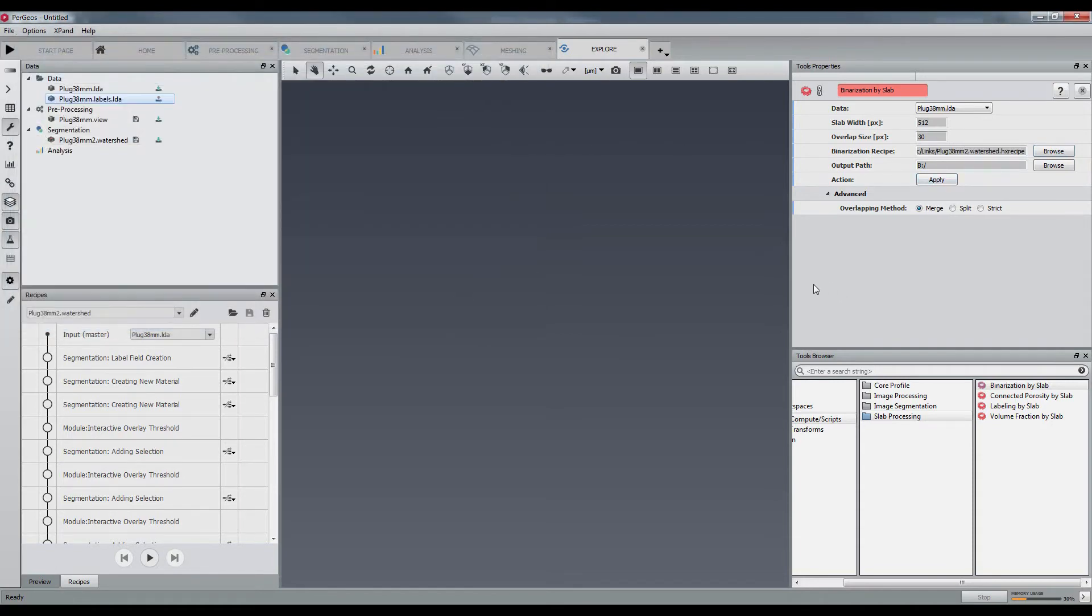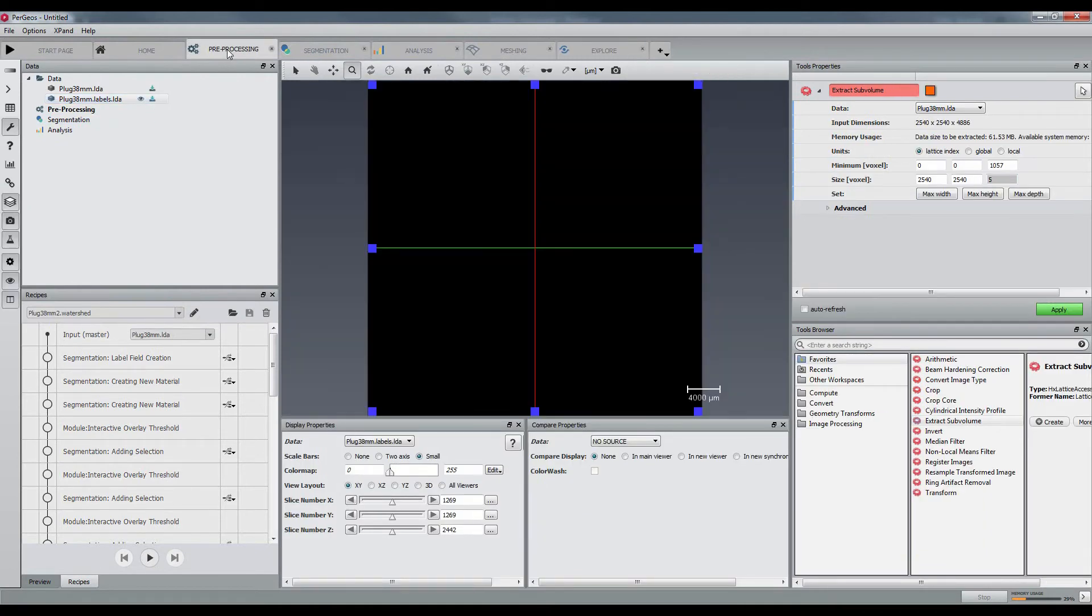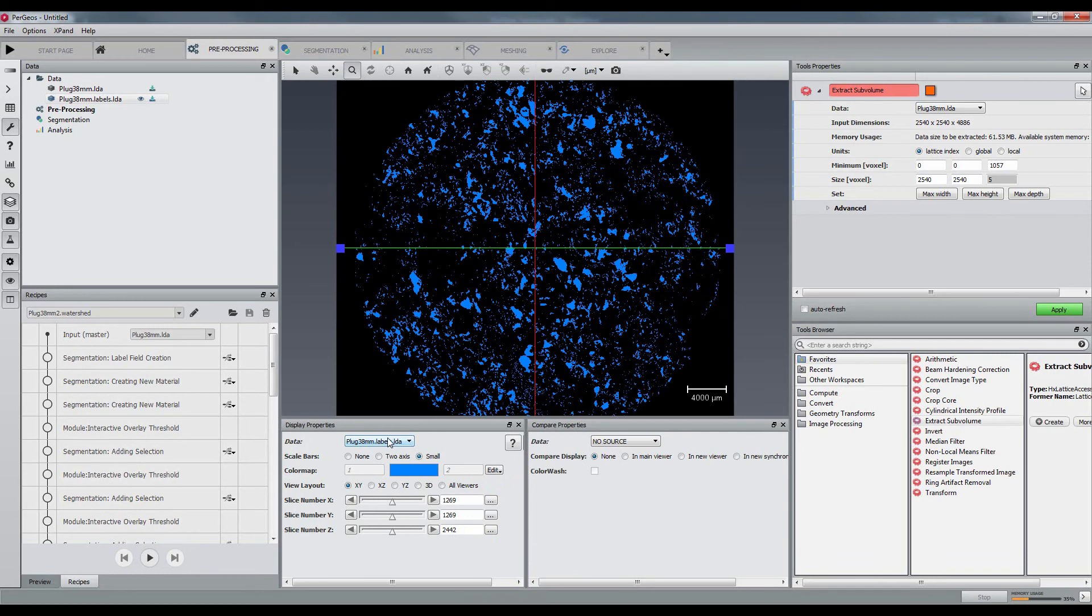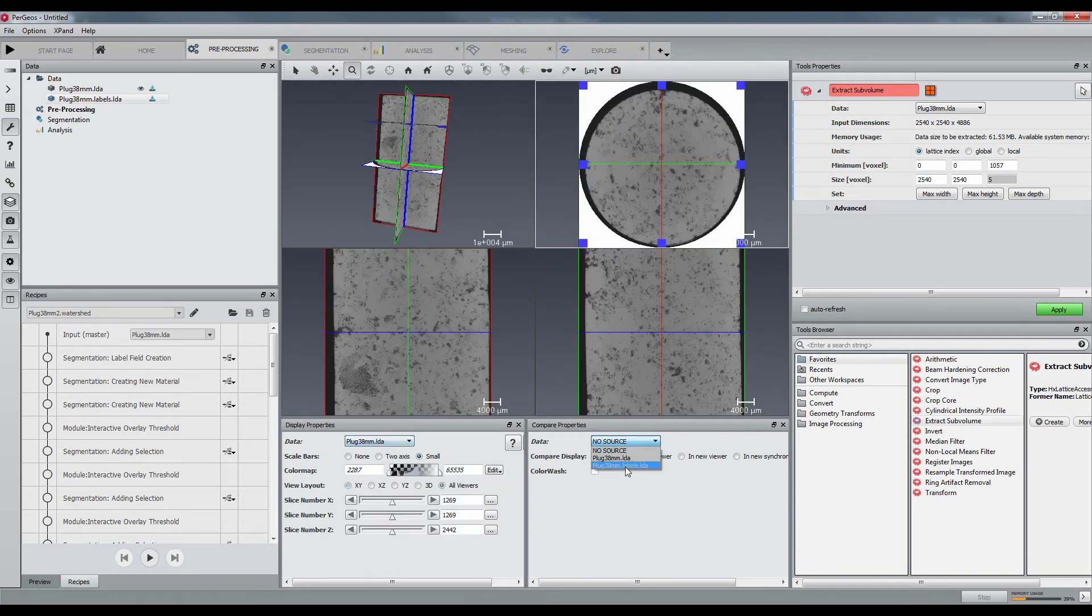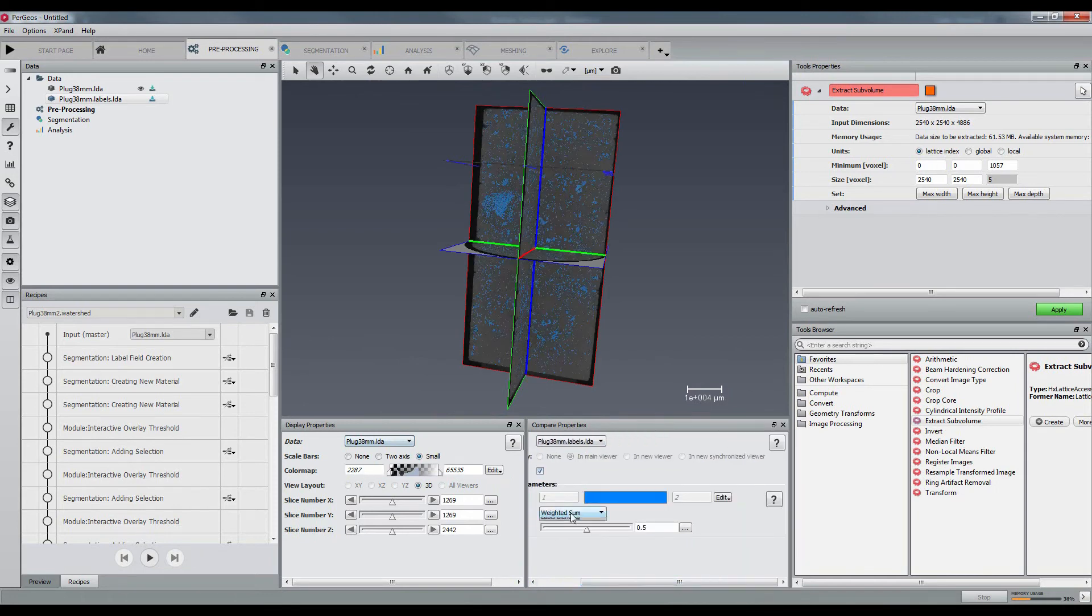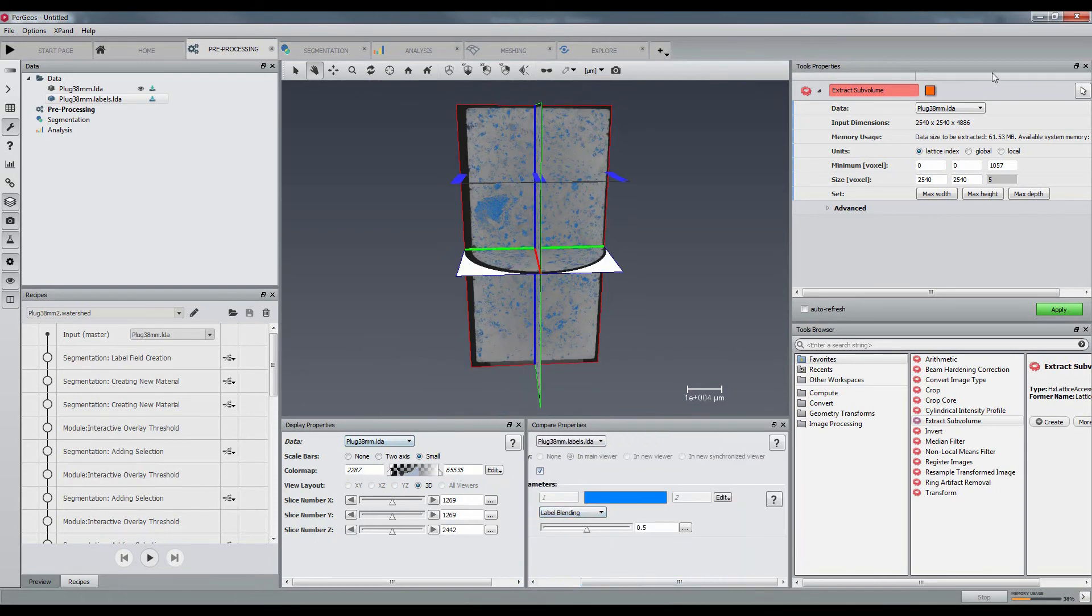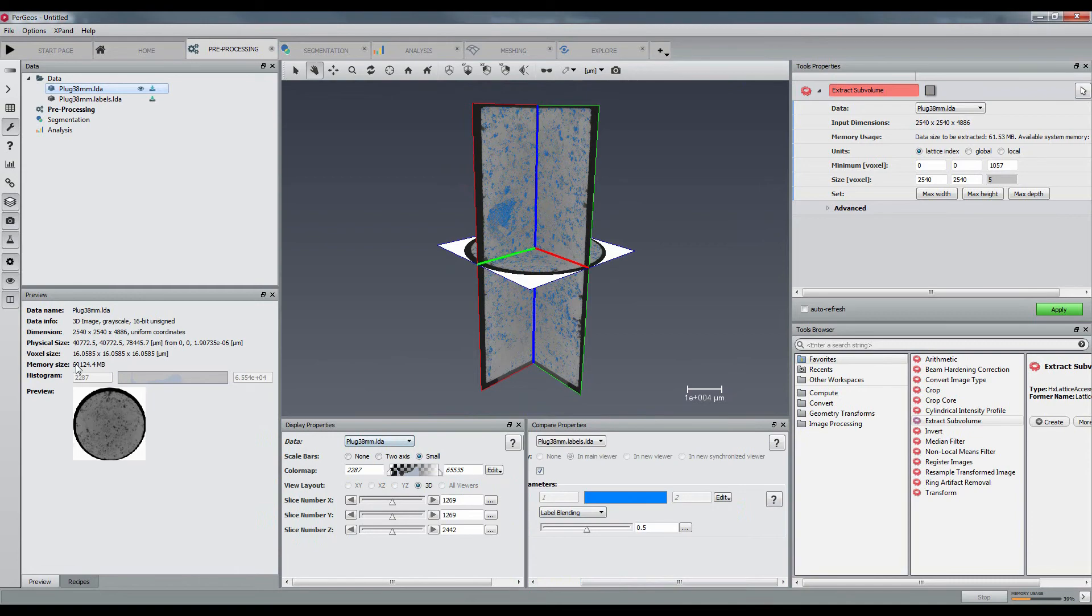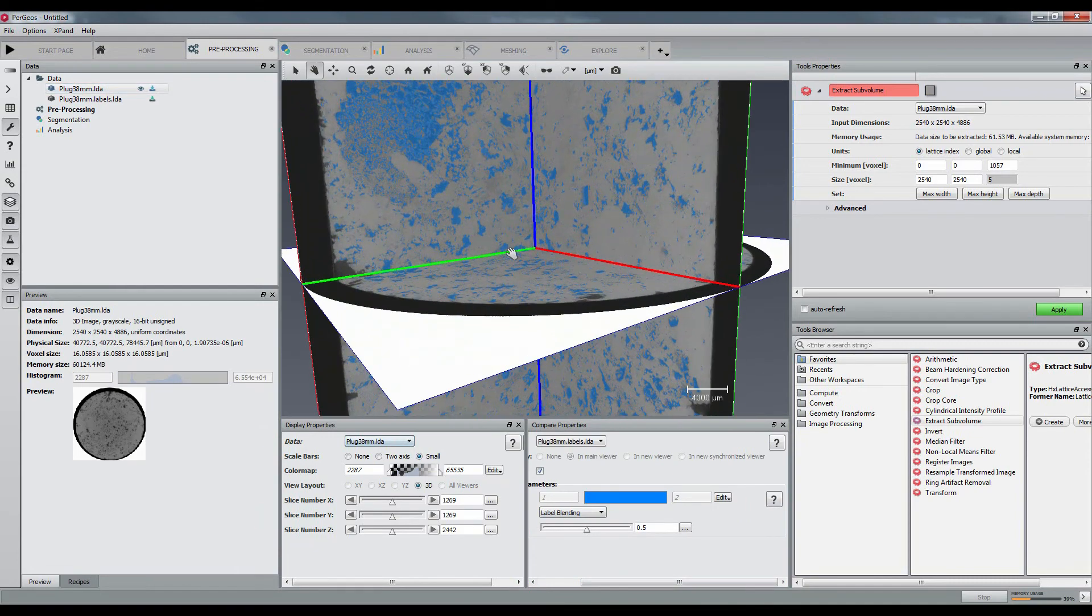When the computation finishes, an LDA data is saved on the disk and loaded in the data tree. It is then possible to check the results on the entire plug. Note that you are handling 90 GB of data using only 5 GB of memory.